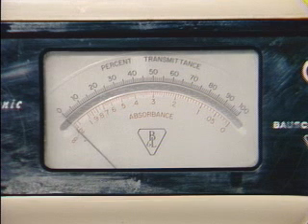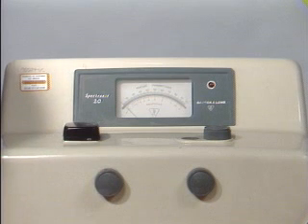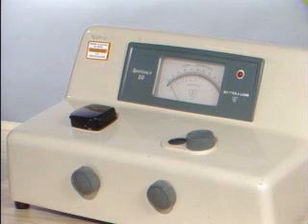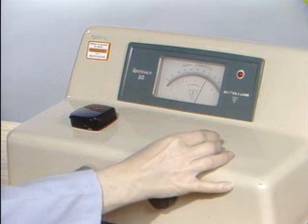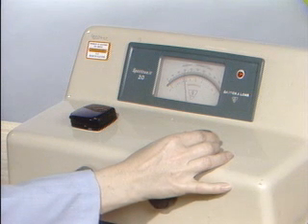When these calibration adjustments are completed, the spectrophotometer is ready for measurement of colored solutions, such as this blue copper amine complex solution. There are three steps in the procedure to analyze a colored solution. The first step is to obtain a spectrum, or graph, of the amount of light absorbed versus the wavelength of light. The colored solution is placed in the spectrophotometer, and the wavelength is changed systematically to obtain measurements of wavelengths and the corresponding absorbance. These data are recorded and plotted.